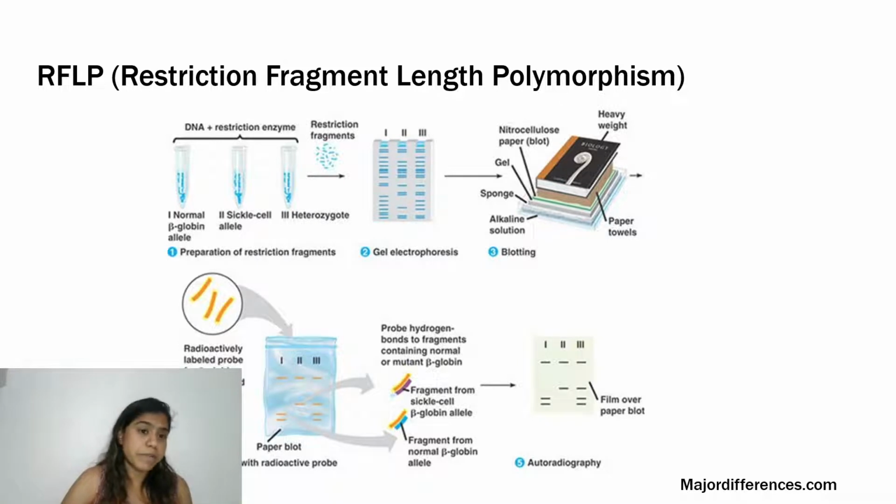So that was one method to separate different genes with single or double mutation points. But there are also other techniques similar to this to understand how these mutations happen in these microbes and how they convert them into different strains or different phylotypes. Another very interesting technique is restriction fragment length polymorphism. So this is to assess polymorphism at the sites that can be cleaved by these restriction enzymes.